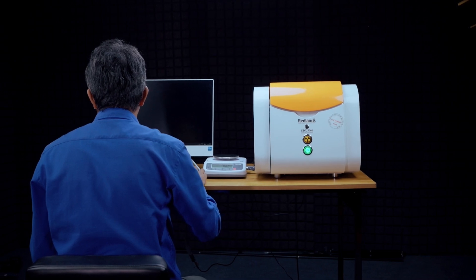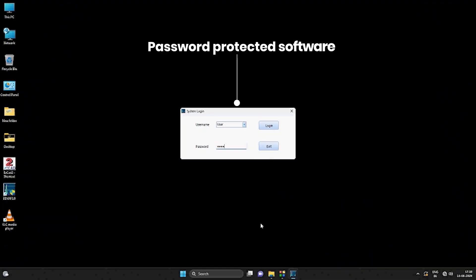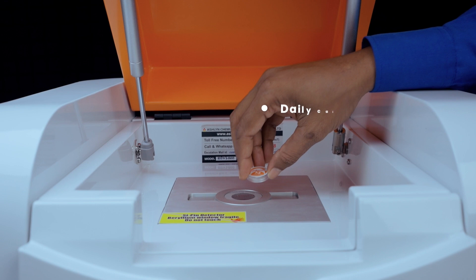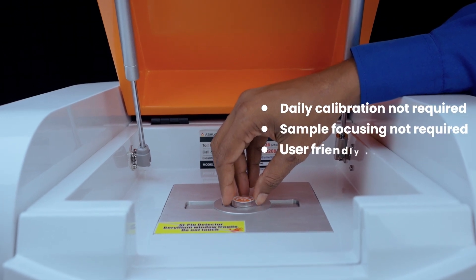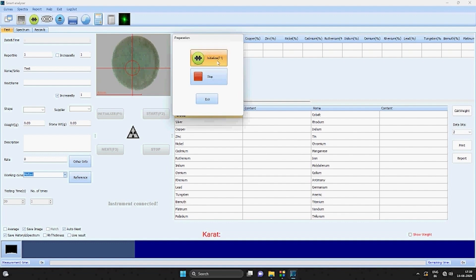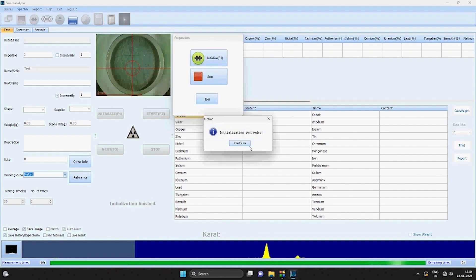Password protection features help avoid unauthorized use of the machine. The initialization process takes just 10 seconds with a silver sample, allowing users to verify machine stability before testing ornaments.